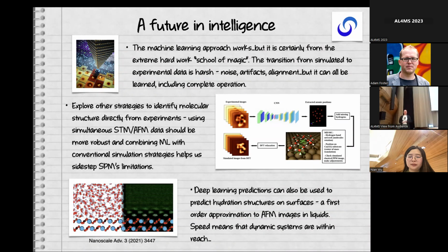Some people have. I think the actual ice experts have been playing with this, but it seems to make things very slow. The high level neural network potential for this ice, I think, was only 2 or 3 times faster than DFT. Cool, but it's better than DFT in this sense.